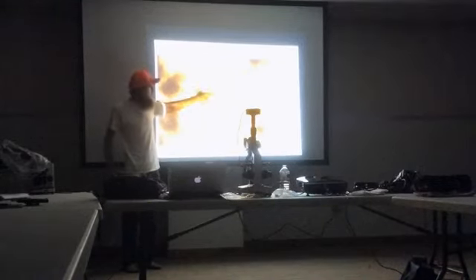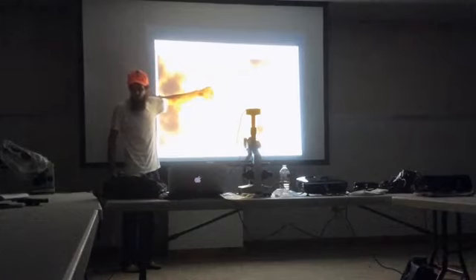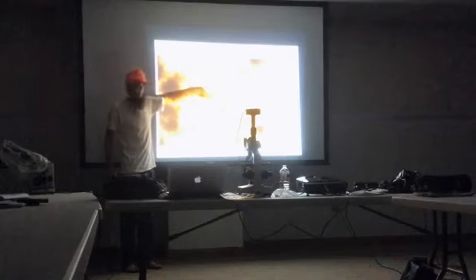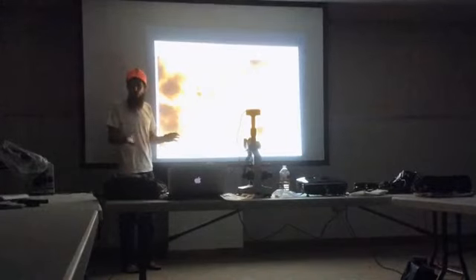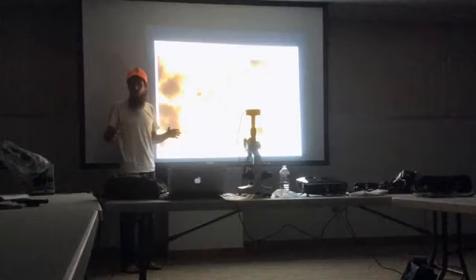But I would say because this guy is much thinner, he's only about 2 micrometers across, that this chunk is most likely not actually a beneficial fungus. Even though he is of the dark color, the size makes more of a difference, and the color is the secondary part of that.